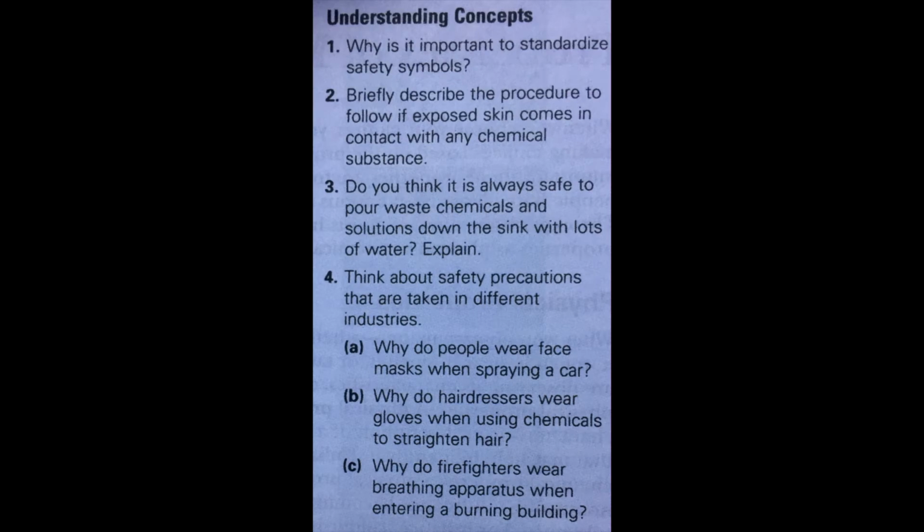Understanding concepts. Why is it important to standardize safety symbols so that everybody understands the same bottle and the same dangers equally well? Briefly describe the procedure to follow if exposed skin comes in contact with any chemical substance. If there's harm for you if you touch a chemical, you're not going to be using it anyway in a classroom. But any chemical, before you use it, you should always know the dangers and what to do.